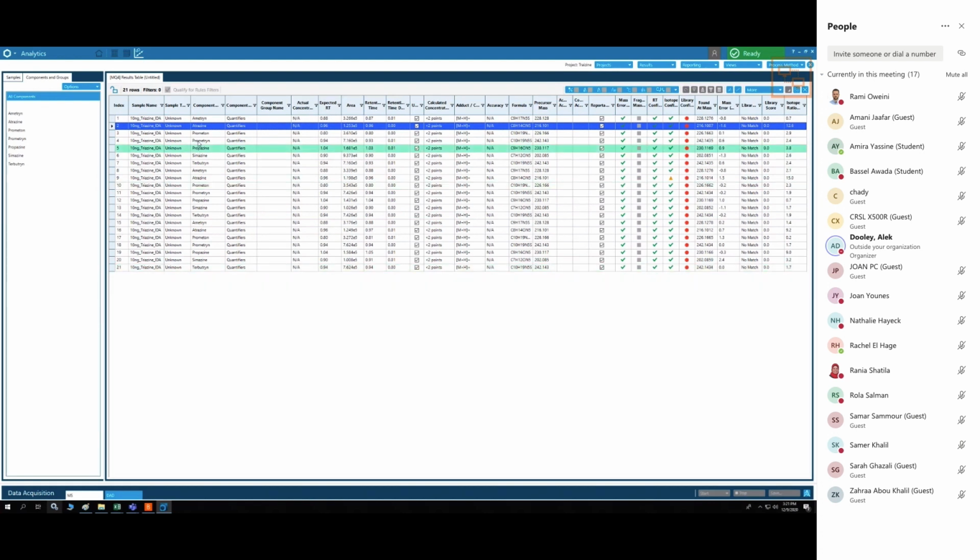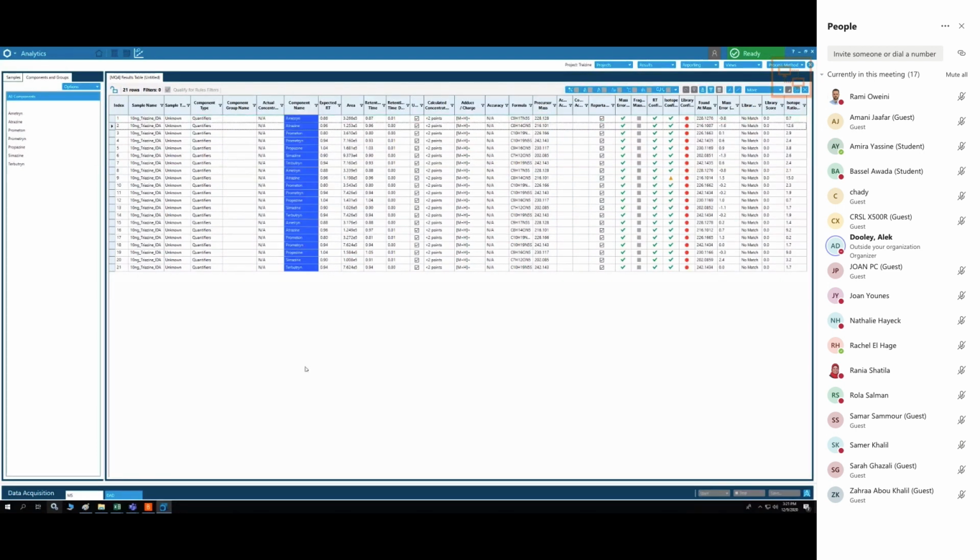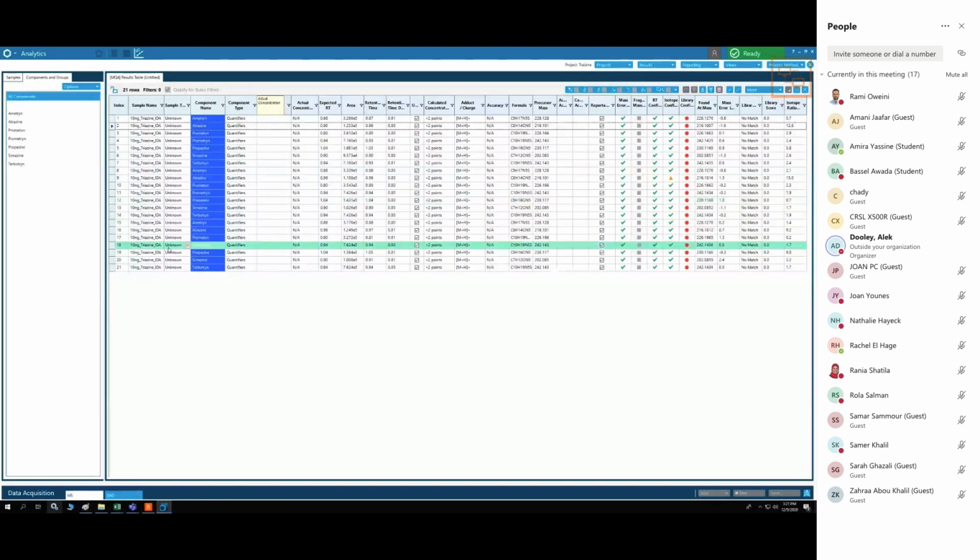You can also move the columns around. If I highlight a column like this, and then I click and drag from the top, I get two black arrows, and the column can be moved to that position. So really, the software is, at this point, excellent, in that you can create a layout that helps you see the data that you want to see.